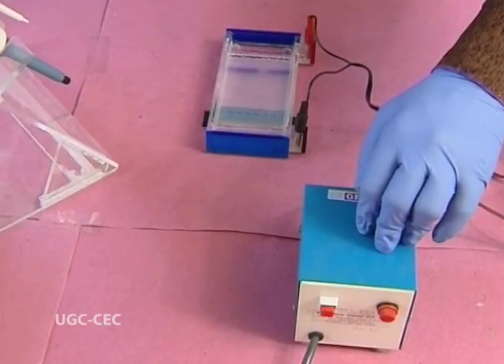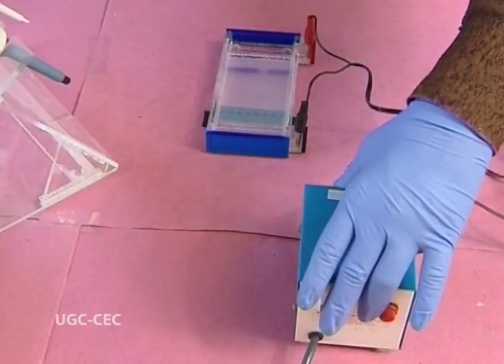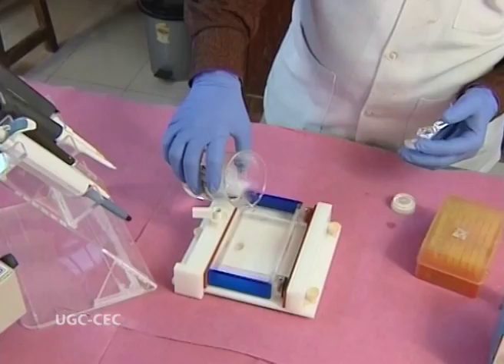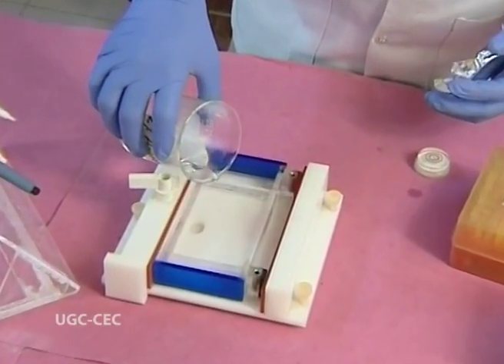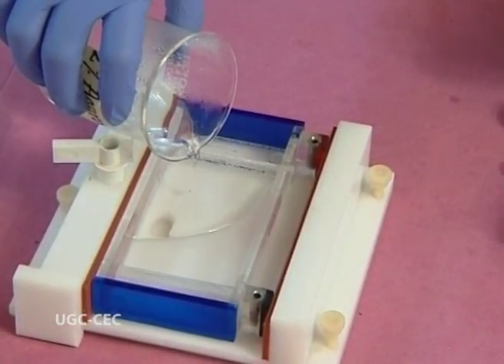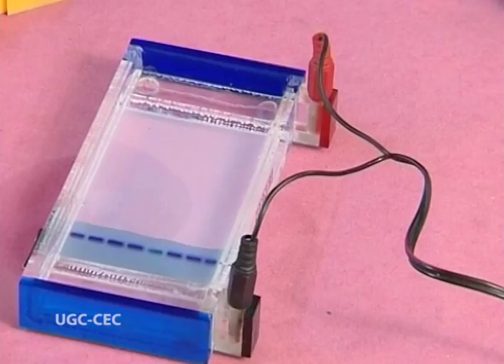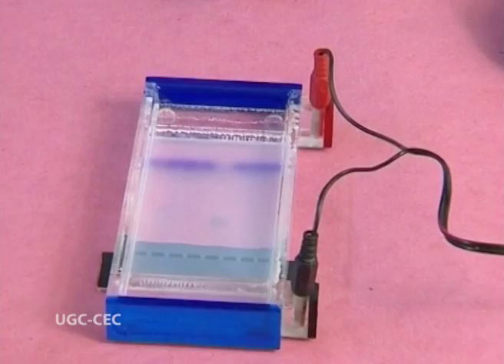Basically, the electrophoresis component consists of two different units. One is the power pack and the other one is the electrophoresis unit. The power pack has variable current and it can be set accordingly, whereas the electrophoresis tank is used for casting the gel where the samples are loaded, and in the buffer, in that media, the molecules migrate. It has to be kept in mind during this technique that the current has to be constant. If very little current is applied, it may result in diffusion, while on the other hand, if the current is high, it can result in smiley bands.